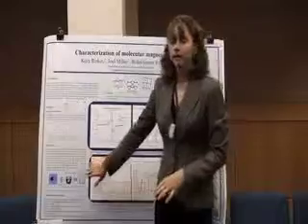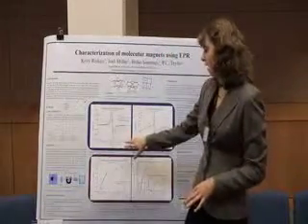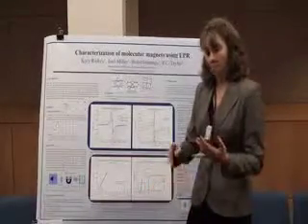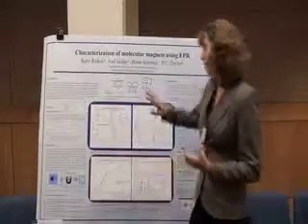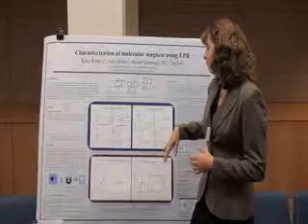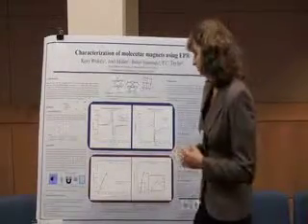So we ran these two samples with EPR at 10 Kelvin, took it down to helium temperatures, measured it at 10 Kelvin all the way up to 80 Kelvin for this sample, and up to 260 Kelvin for this sample, in 10 Kelvin increments.